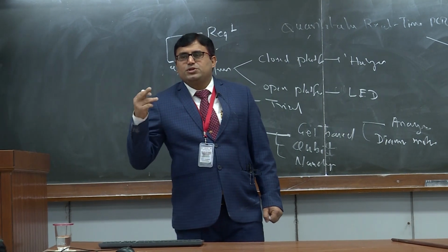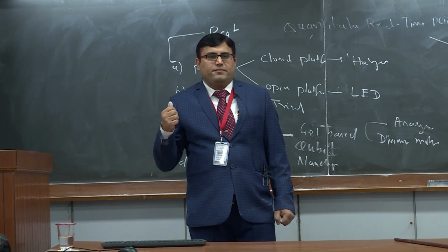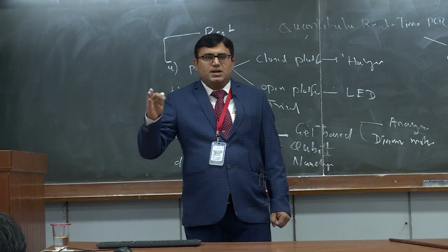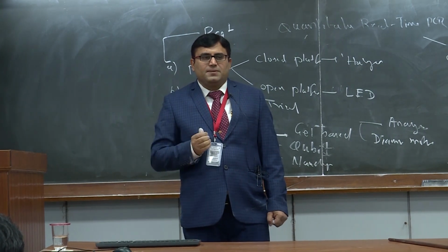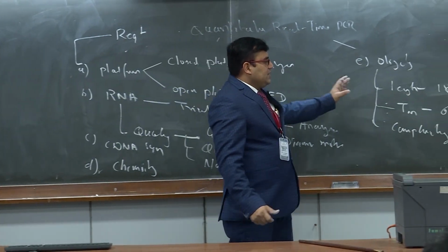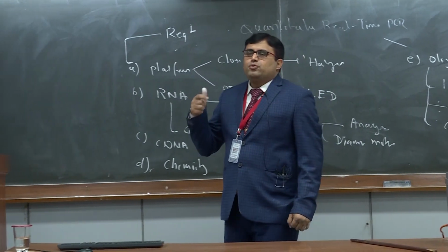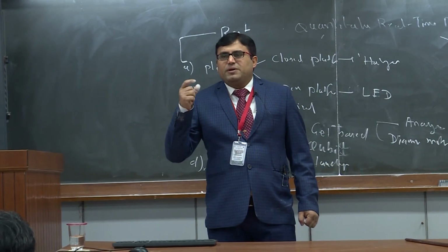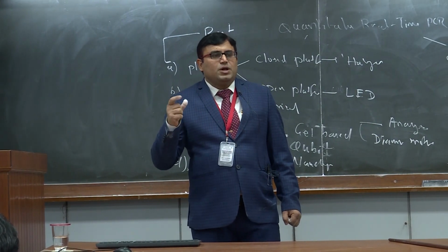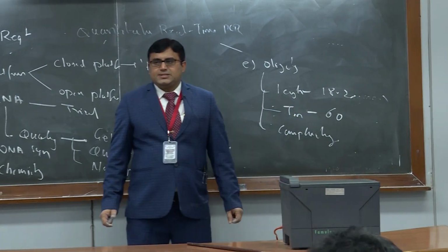The primer which you are going to use for real-time expression should be HPLC purified. Many times a common primer is used and then the expression will be very bizarre. You will not be able to correlate. It should be HPLC purified. So let me repeat once. I told length 18 to 20 that you can prefer. Tm should be 60. A few people prefer 58 as a Tm, but that is the optimum for cloning. For expression analysis people prefer to use 60 degrees Celsius.